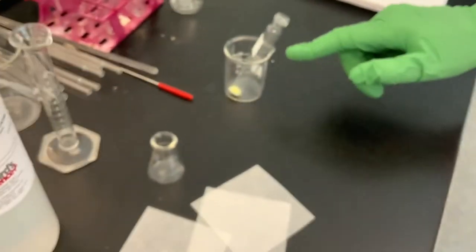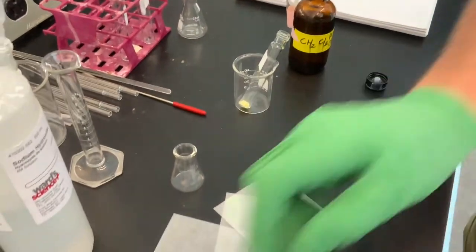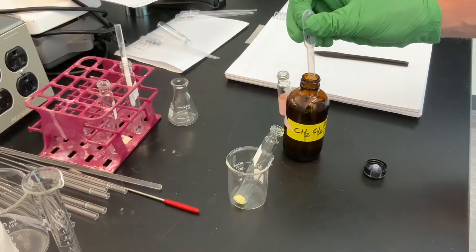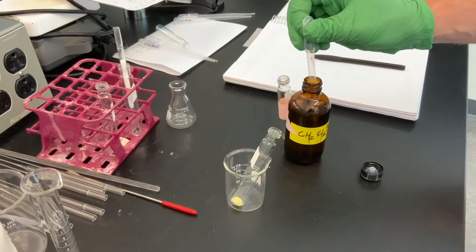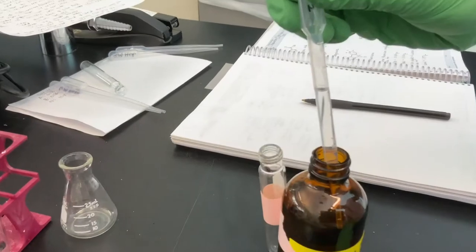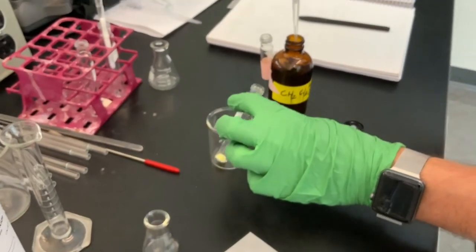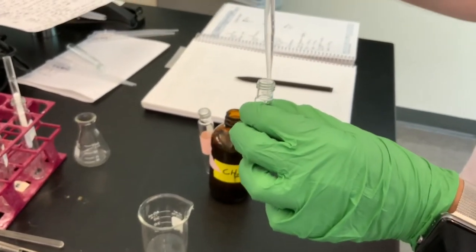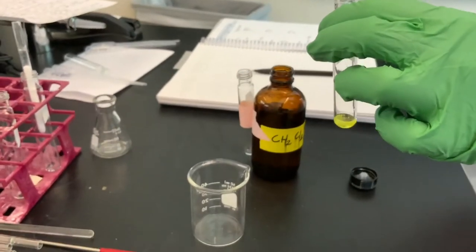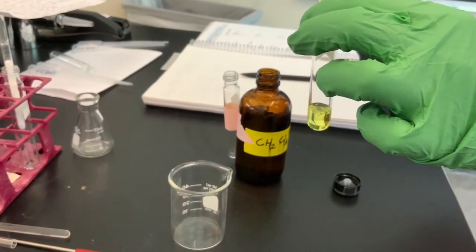All right, so now to this culture tube, we are going to add 2 milliliters of methylene chloride, and methylene chloride is going to dissolve each of the organic solids. I'm using here just a graduated plastic disposable pipette. And this level here, if you can see it, the graduation says 2 ml. So I'm going to quickly add this, and I'm also going to rinse the sides of the culture tube so that all the compound that stuck to the sides goes down and meets the rest of the solids.